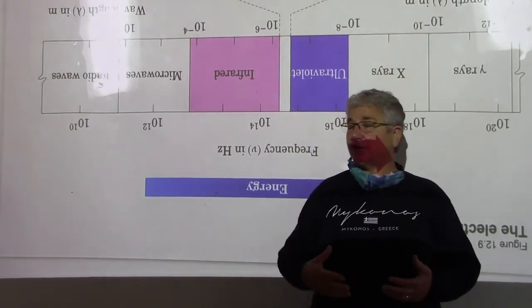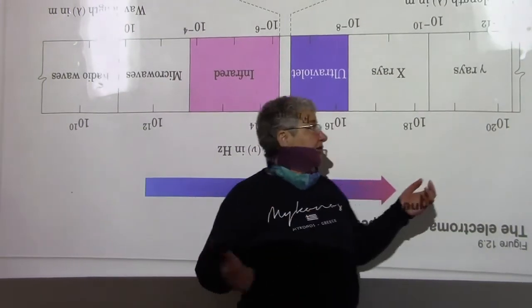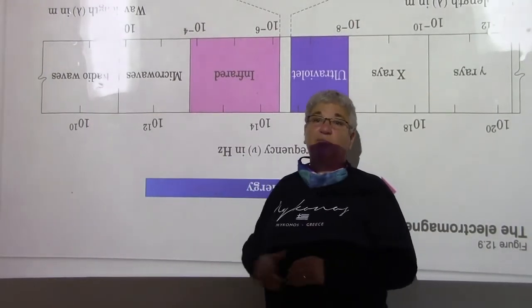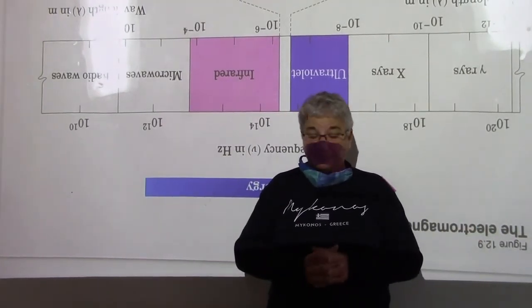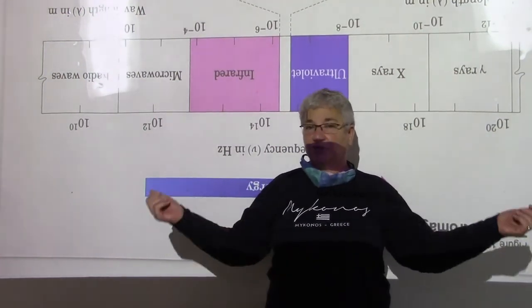So it's not causing the nuclei to flip, that's down here, and it's not breaking covalent bonds, that's up here. Right, so what happens with infrared? It's not rotation of bonds, that's what microwaves do. What infrared radiation does is it actually gets your bonds to bend and stretch, right?